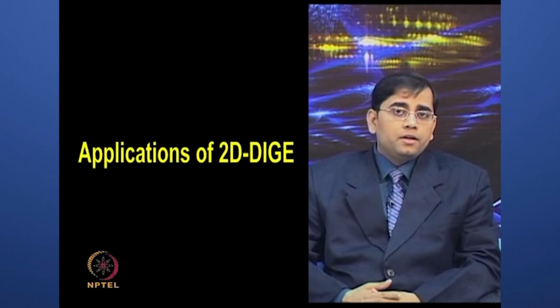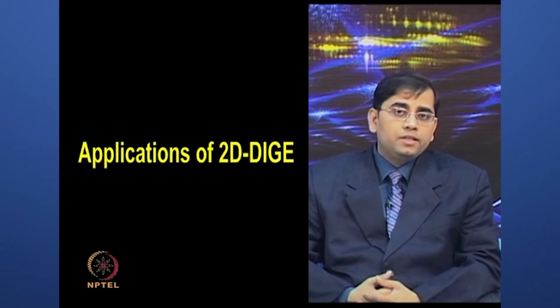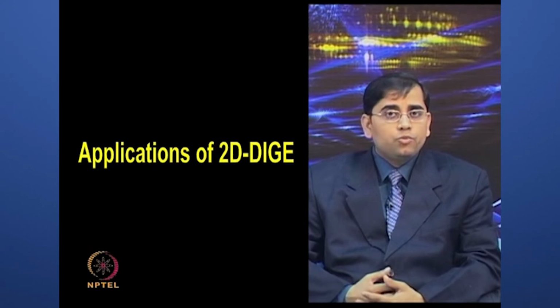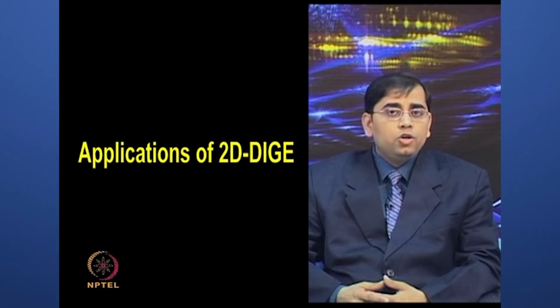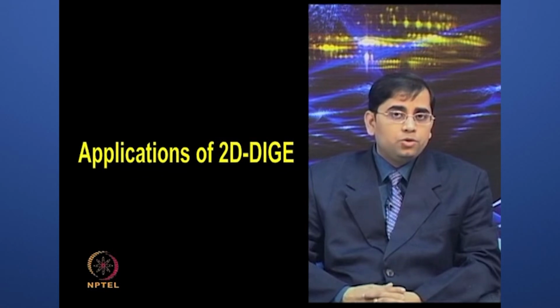Now, proteomic investigations are quite promising, but there is a major limitation of using conventional 2-dimensional electrophoresis. If you remember earlier lectures, we discussed why some of the inherent limitations of 2DE need to be overcome with some more refined techniques, and that is where 2D DIGE came into play.